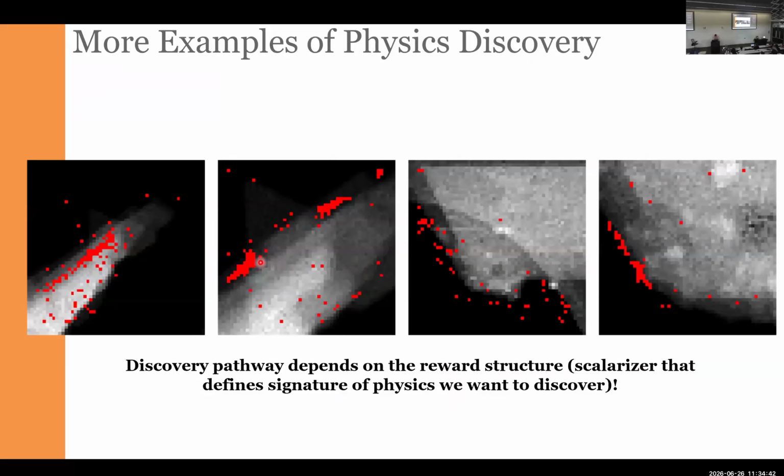And this is what happens if you run the experiment on several different flakes. Immediately you start to see things that are interesting. For example, we definitely know that the algorithm explores the edges. That makes perfect sense because we look at the ratio of the edge plasmon peak to the bulk plasmon. But there is a but.